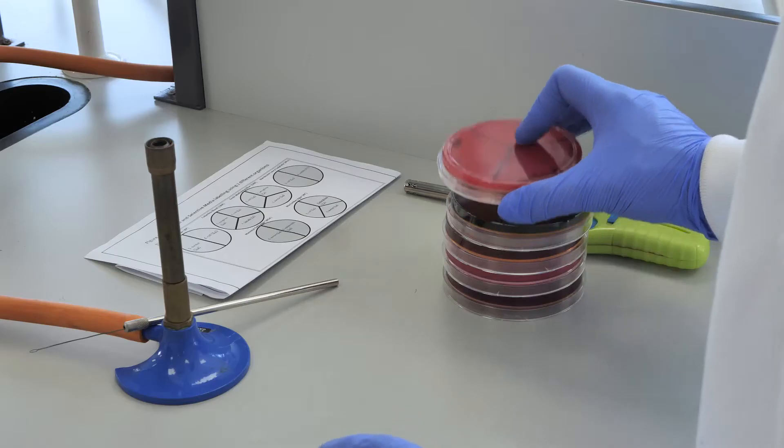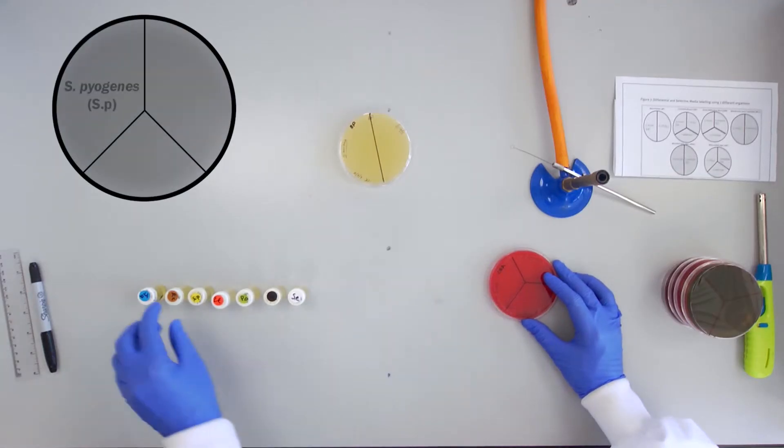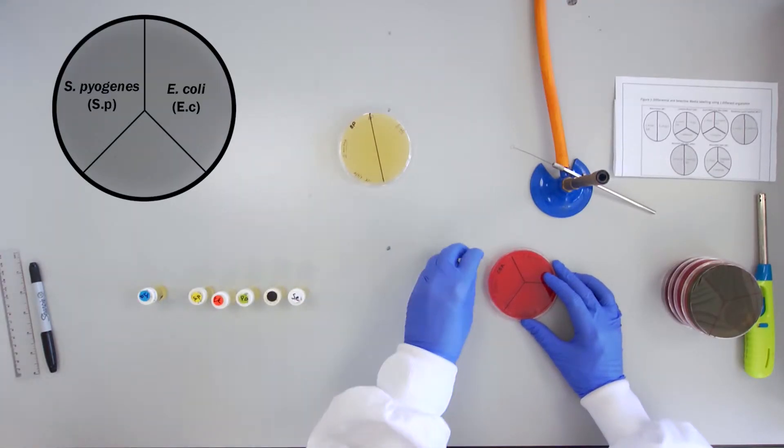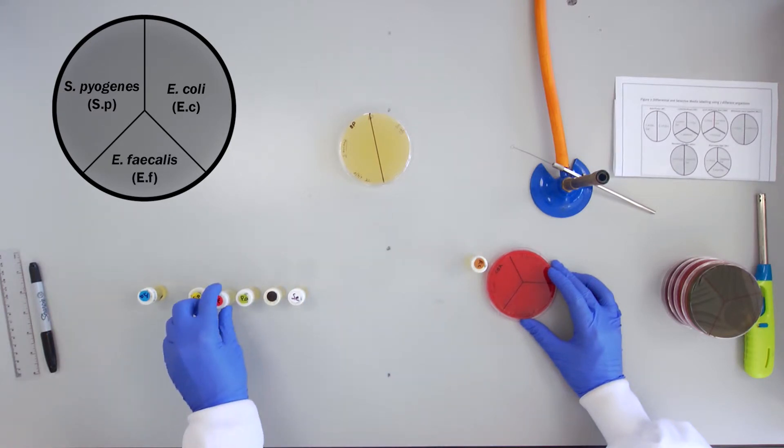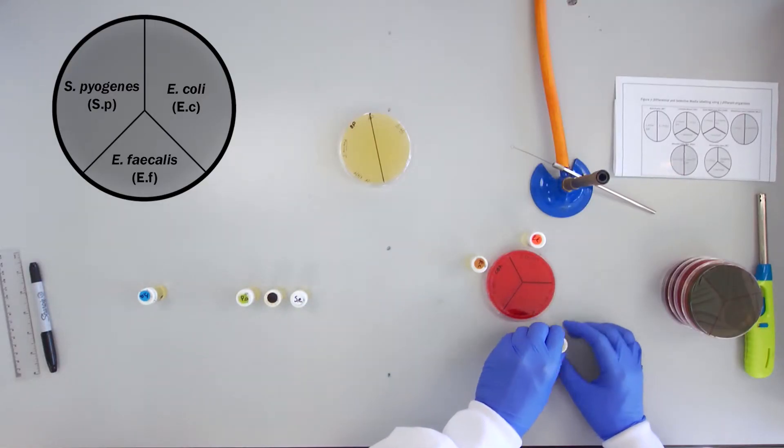The Columbia blood agar or CBA is a rich red color and will be inoculated with Streptococcus pyogenes, E. coli, and Enterococcus faecalis.